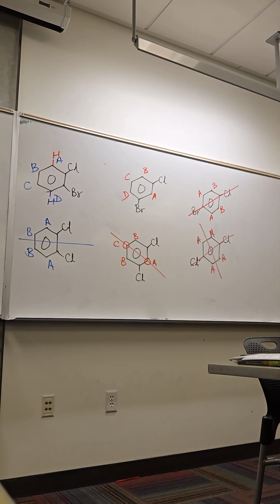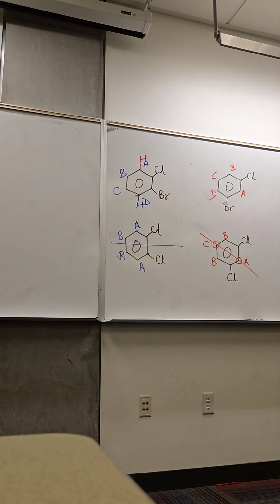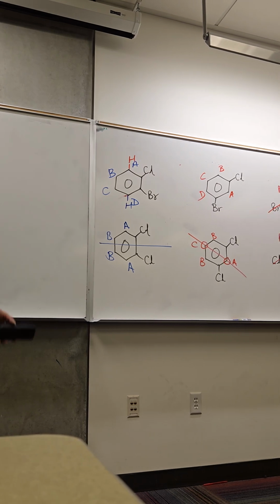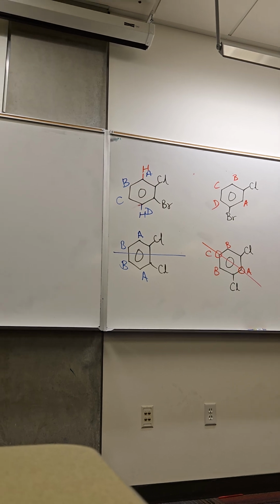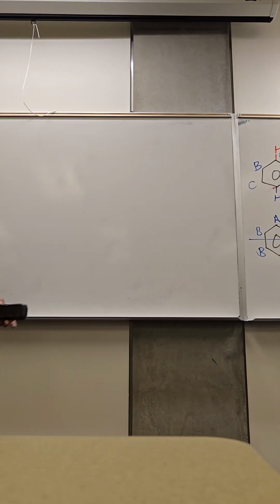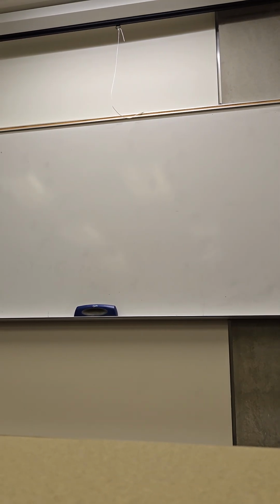But ours is very, very weak. Ours is a 60 megahertz instrument. That's the strength of the magnet that we have. Typically, universities use 500 to 700 megahertz instruments. I would love to get one, but yeah. I hope I answered your question. Yes, you did. Thank you.